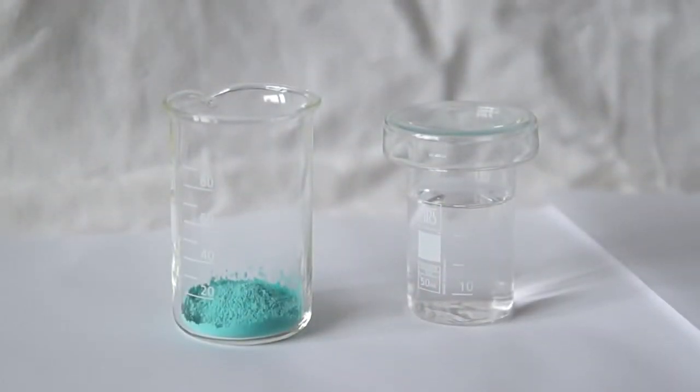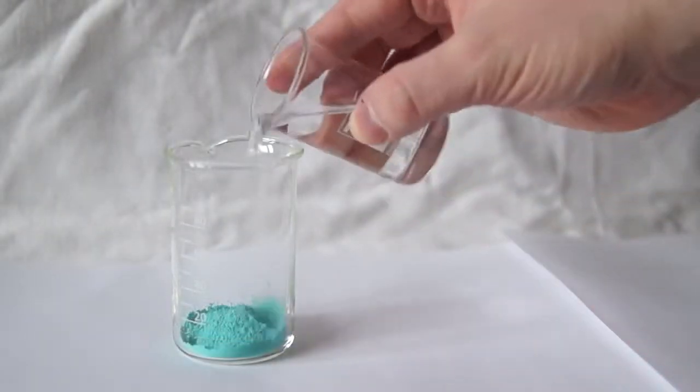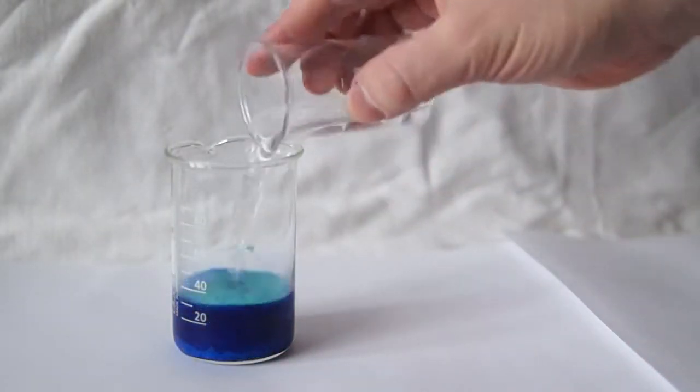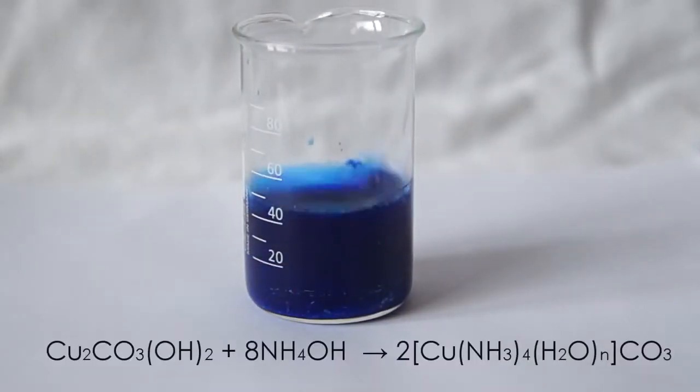Next we need a concentrated solution of ammonia. Here I have approximately 40 milliliters of 25% ammonia solution. Now I will pour this ammonia solution onto the copper carbonate. This forms a complex compound of copper which has a bright blue color.